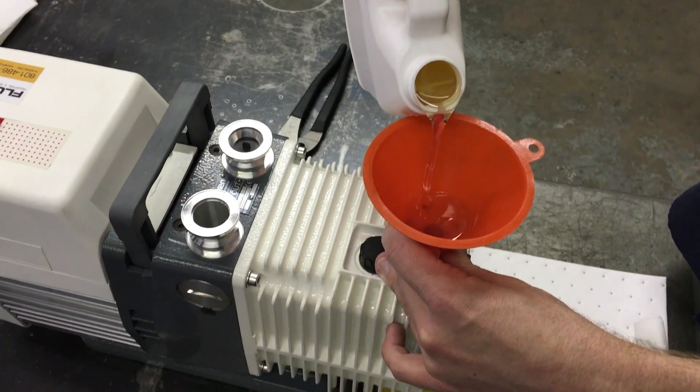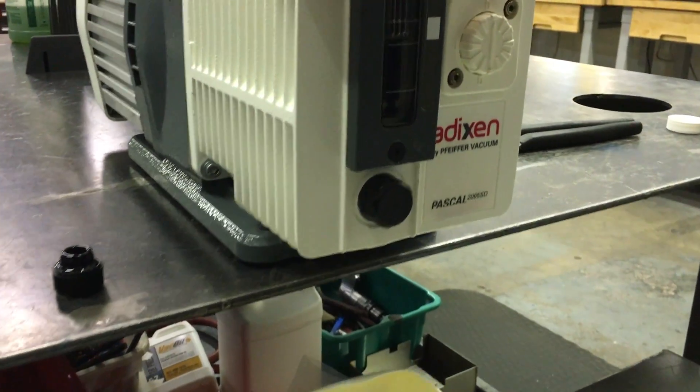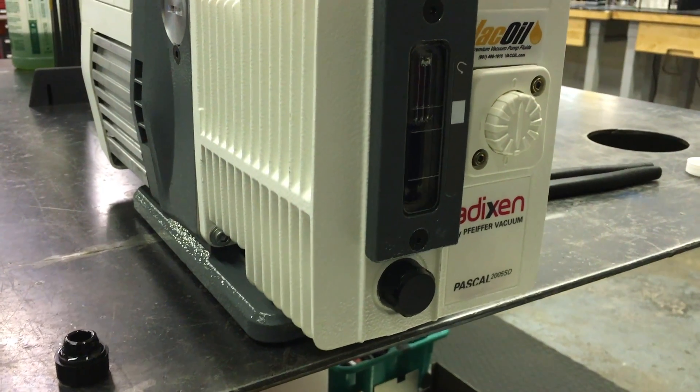As you fill the oil reservoir, keep an eye on the sight glass for fill limits. Fill to the upper limit of the designated range.